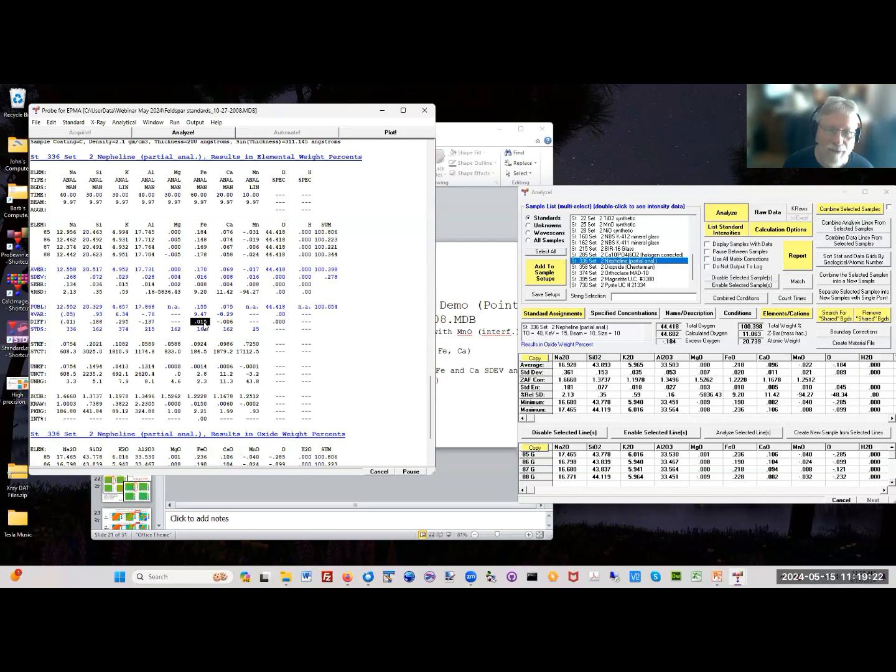It's only 150 ppm. Our standard deviation is 160 ppm, so it's essentially within one standard deviation, certainly within 3. And here we're low by 60 ppm. When you have a small number, a large percent variance, relative difference, it looks big, but it's actually smaller than our precision of our measurements here.